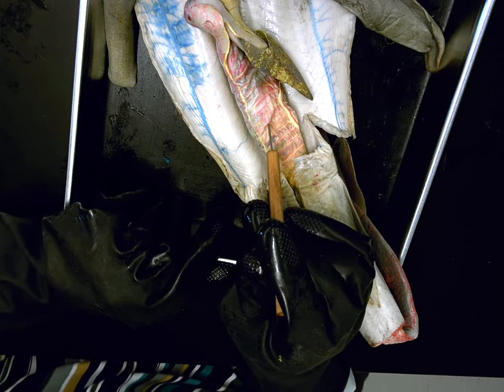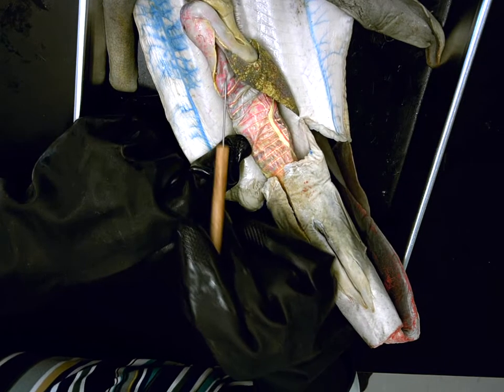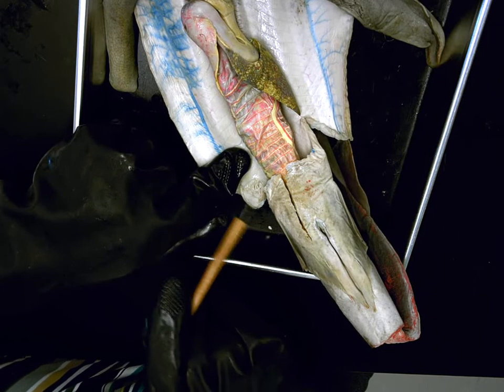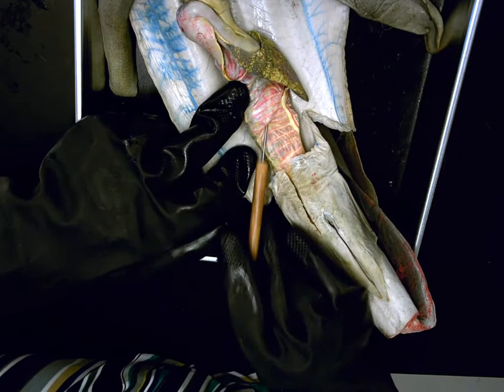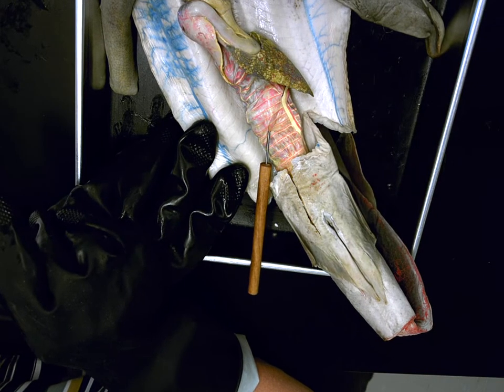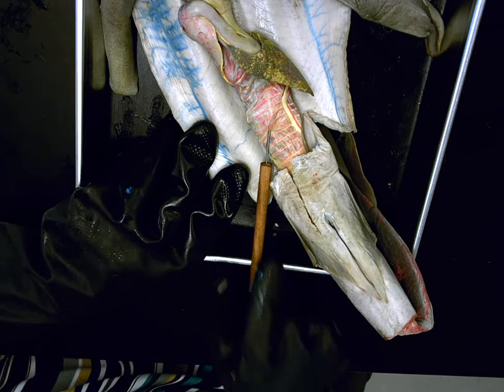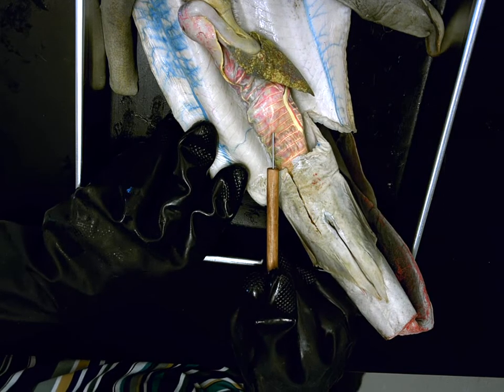Danielle, give me the functions of the intestine. To absorb nutrients and continue digestion. Excellent. What is the top portion called, Rachel? Duodenum. Excellent. Marilla, bottom portion? Ileum. Excellent. Inside, if I pin it and I ask what is found inside of this structure, Henry, what would I say? The spiral valve. Spiral valve functions. Slows down food passage and increases surface area. Excellent.